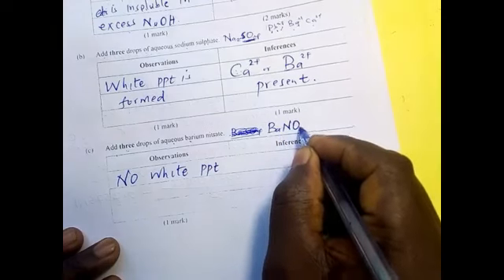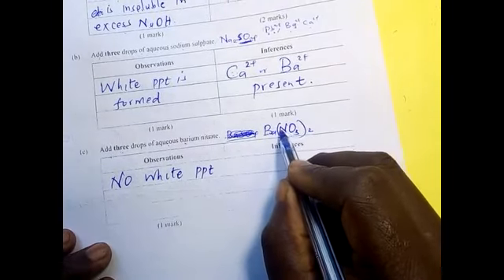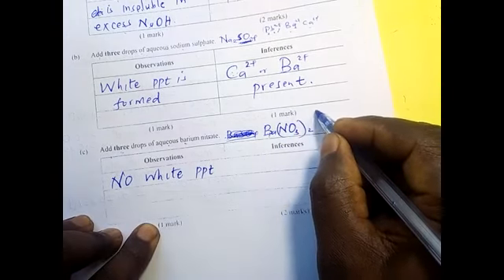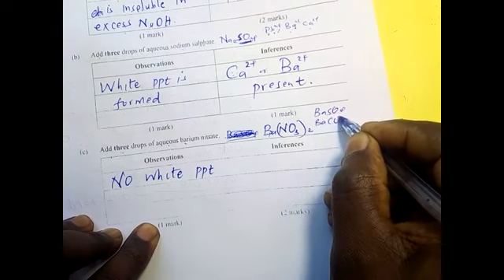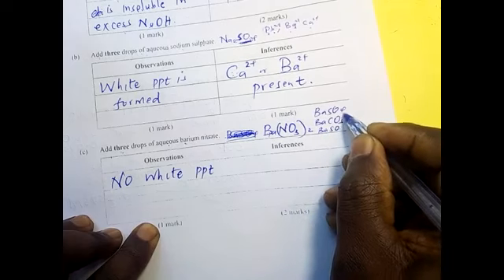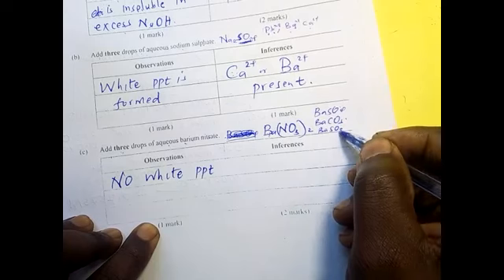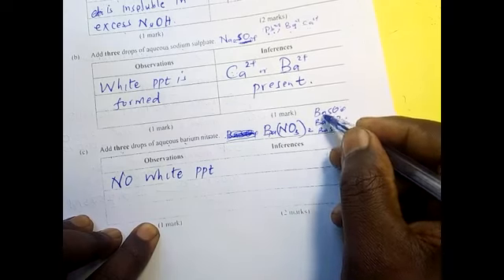Sorry, barium nitrate. Whenever we are adding barium nitrate, we expect a white precipitate, because barium will form barium sulfate, barium carbonate, and barium sulfite. These are the three anions that will form a white precipitate with barium.